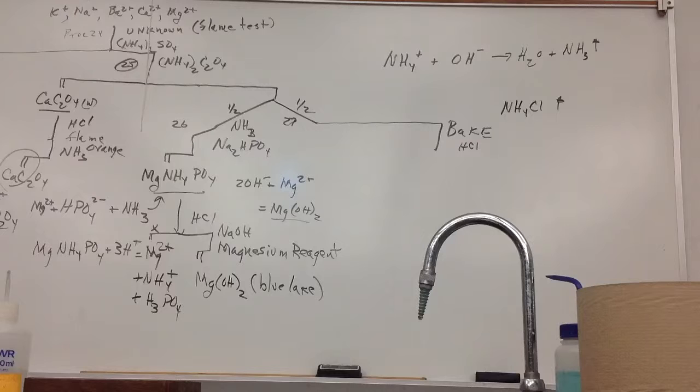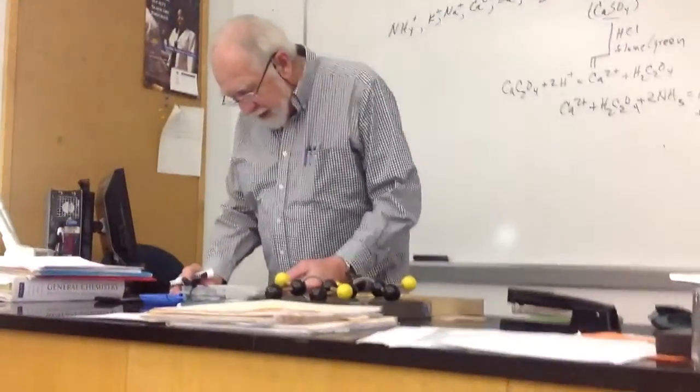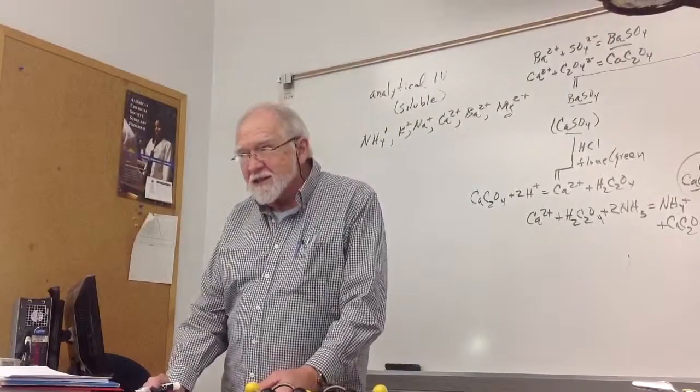Now, what I'm debating, because we're running out of time, I always advertise in 1A we can make insoluble sodium and potassium compounds. And what I always had the students do at this step is on page 235, note 3, it gives you precipitation tests.